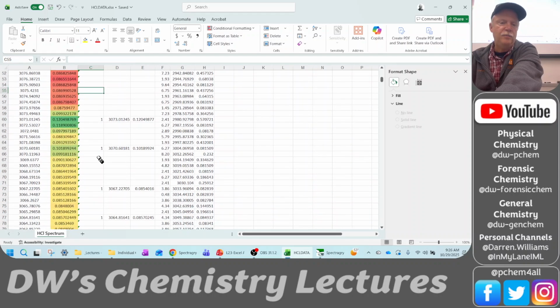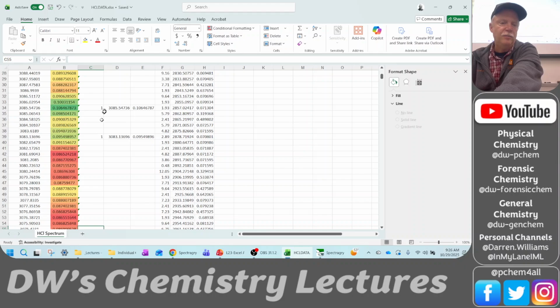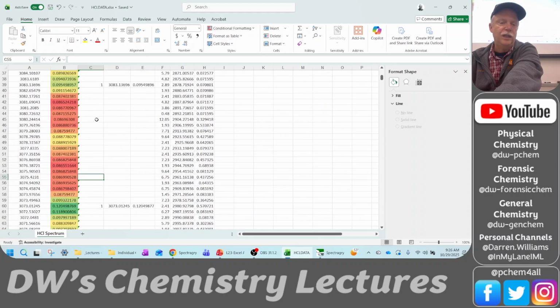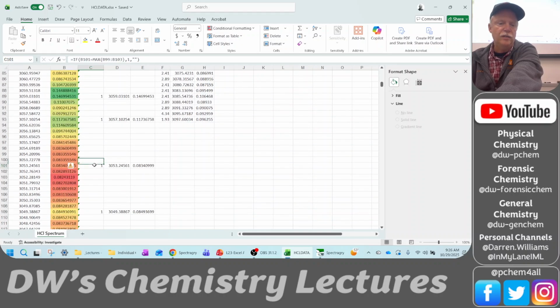Because we should see a nice pattern. See, you have this difference here, and then you have the difference between this line and that one. And then you have a small difference, and then a big difference. And what we're seeing is all of this noise. So we're going to get rid of these guys, spend a little more time getting rid of these false flags.